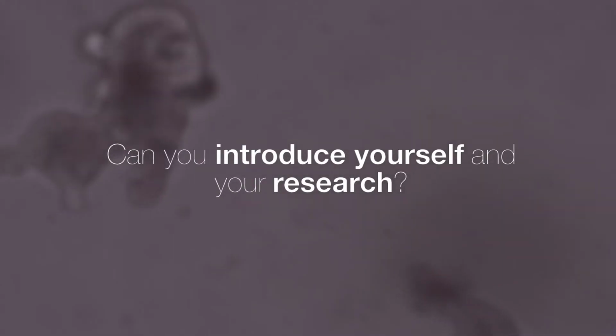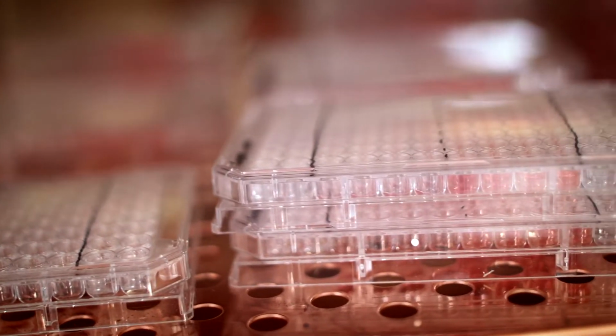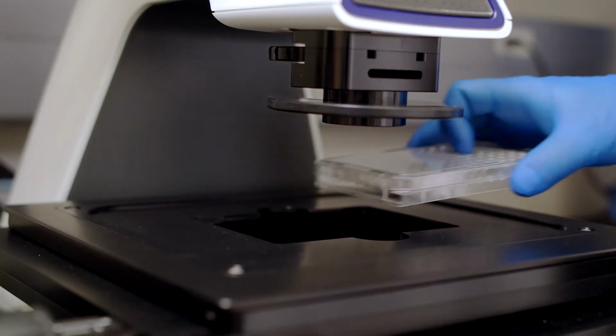My name is Ruchika, and my research is based on cardiac repair and heart failure. Currently I'm working with induced pluripotent stem cells. We put them through a 14-day to 22-day protocol to differentiate induced pluripotent stem cells into cardiomyocytes.